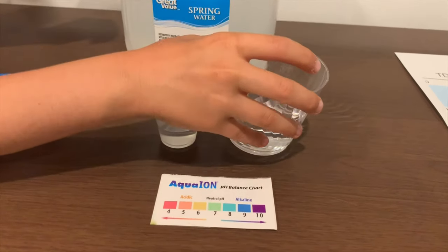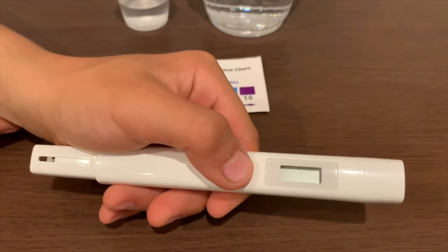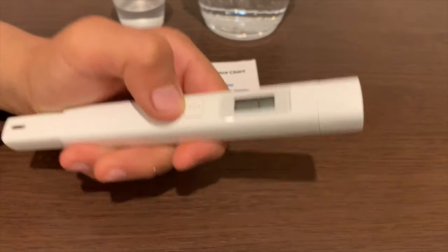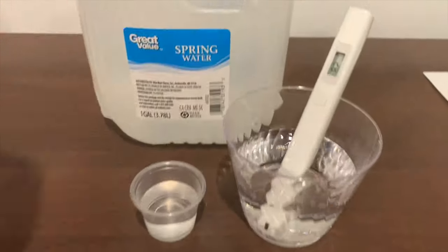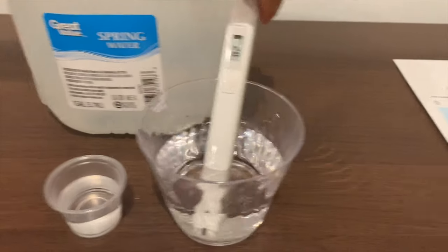First, we're going to test the TDS level. If you want to buy this TDS tester, check the link down below. Turn on the TDS tester and make sure it says 0 before putting it in. The reading is 82 — that is okay to drink.